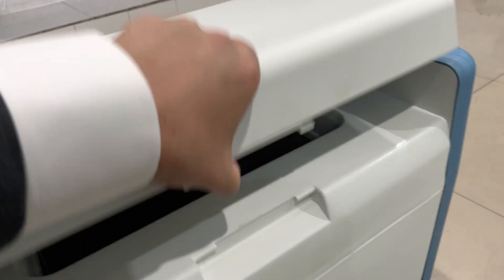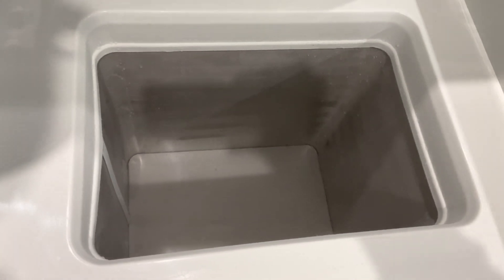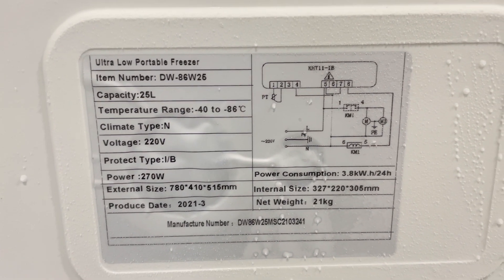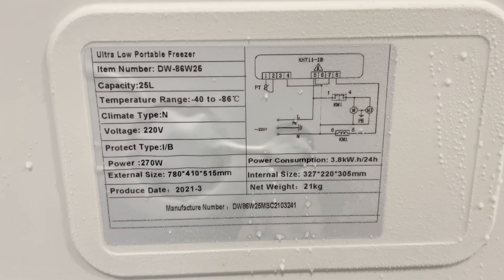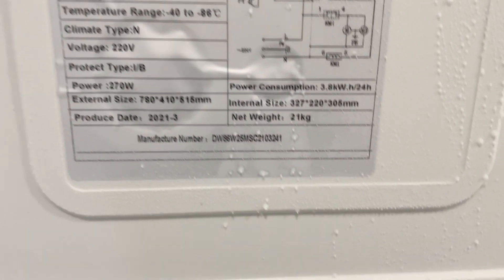Looking on the inside, it's a 25-liter capacity. You can see the voltage it comes with is 220V, but every freezer does come with a converter so you can use it at 110V.